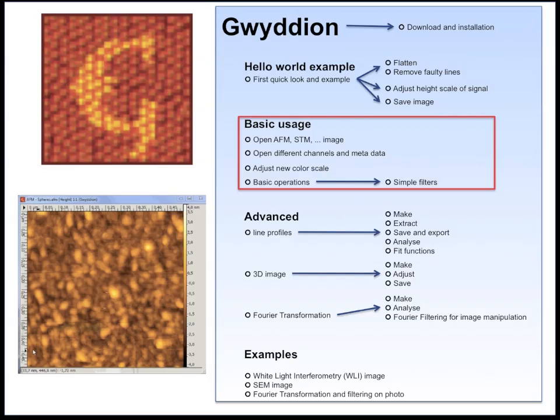Then I will show you the basic usage of the program: how to open different channels of your data, how to apply a new color to your image, and how to perform simple image manipulation such as cropping and applying filters.